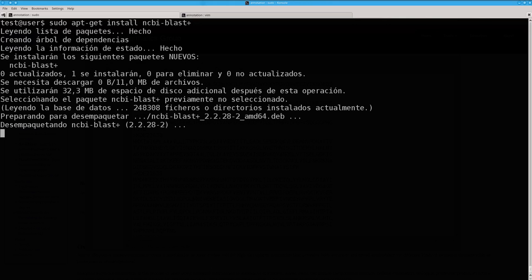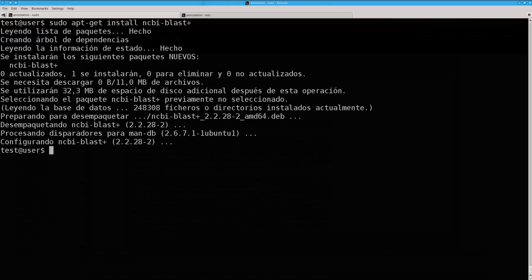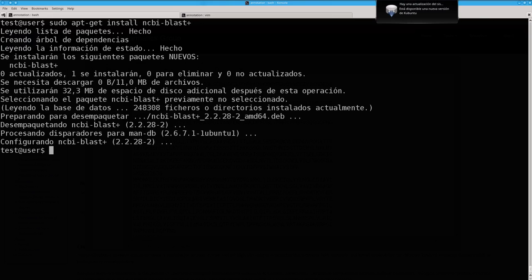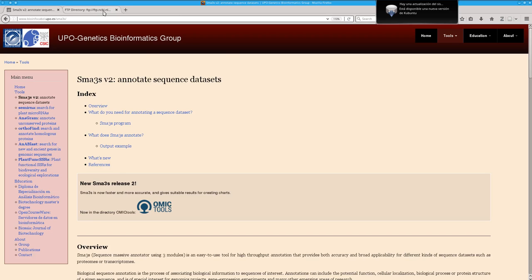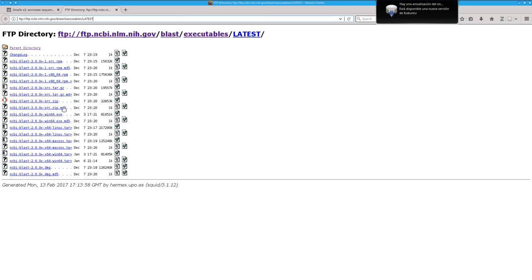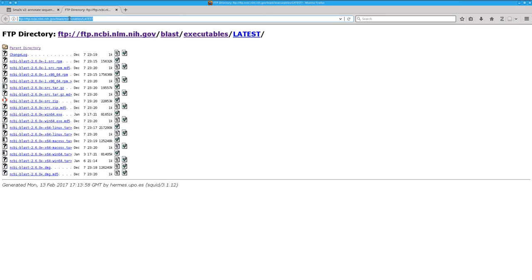Alternatively, you can install the package from the NCBI FTP server. Here you can download the files with the source code.